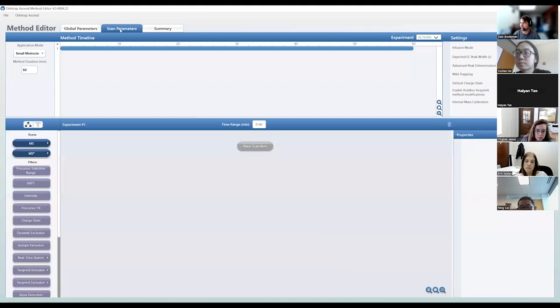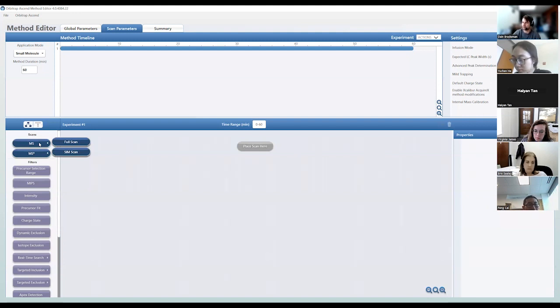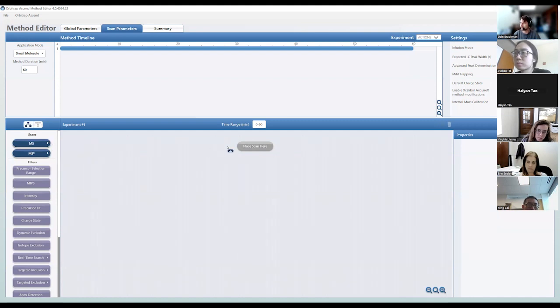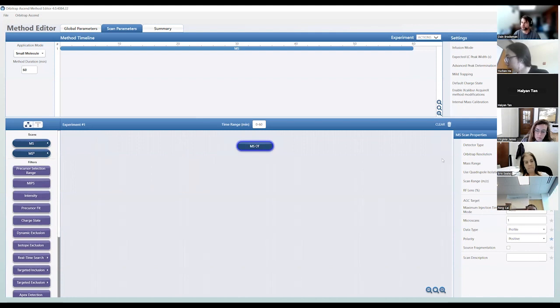Next I'll move on to scan parameters — this is where you get into the nitty-gritty of how the instrument is actually acquiring spectra. For data-dependent acquisition experiments, you go to the experiment tab on the left where all the different options are listed. You'll see similarities with the decision tree I showed previously. The first thing you'll want to do in most experiments is a precursor scan or MS1, and on the tribrids we always do those in the Orbitrap.